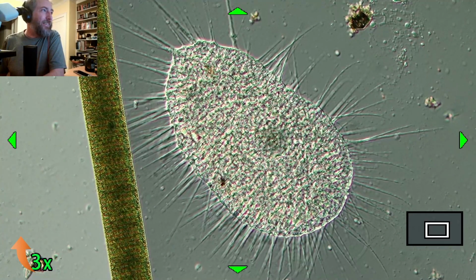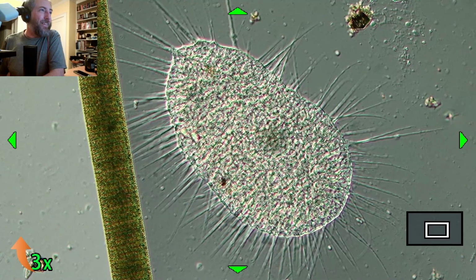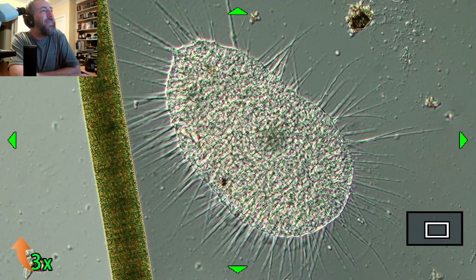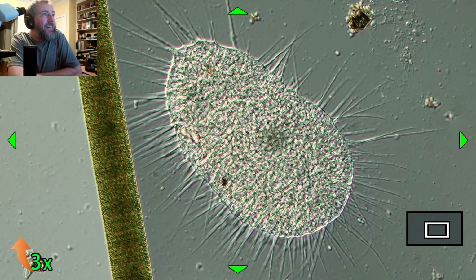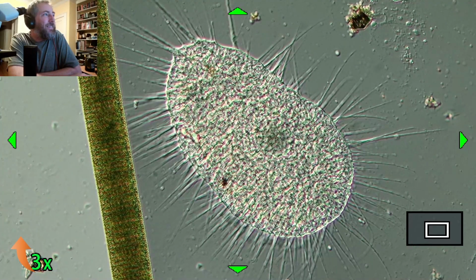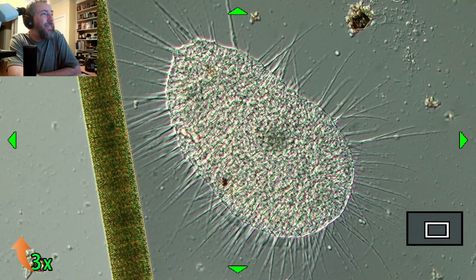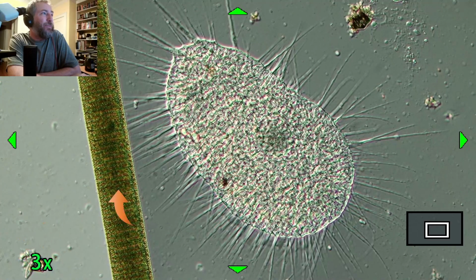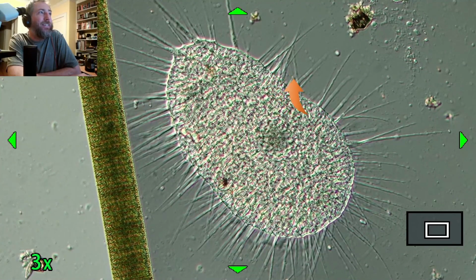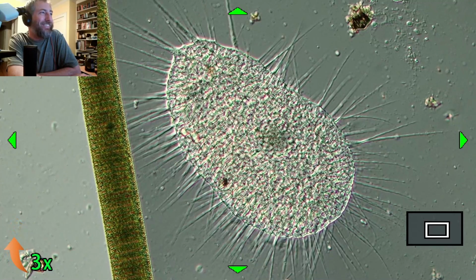Oh, it's moving. It's still alive, whatever it is. Yep. I don't know what that is. It's very possibly an amoeba. That's the hairiest amoeba I've ever seen. But that's probably a better guess than anything I could come up with. I don't see it moving very much, but in here I keep seeing pieces of it move around, and it's not because I'm moving the stage. It's responding to something else.